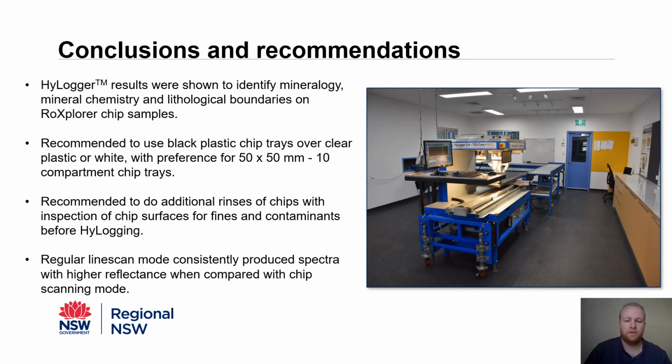To wrap up, conclusions and recommendations included: HyLogger results were shown to identify mineralogy, mineral chemistry, and lithological boundaries on RoXplorer chip samples. Recommended use of black plastic chip trays with preference for 50 by 50mm 10 compartment chip trays. These can currently be purchased through commercial suppliers.